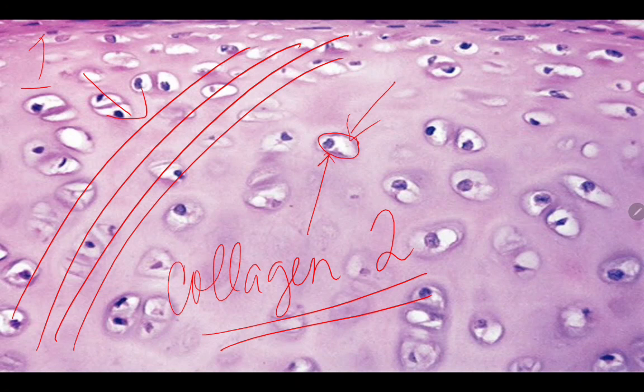So, same thing lang yan siya, guys, no? Meron siyang cell, meron siyang fibers, hindi lang talaga makita. And then, meron siyang area kung saan sila lahat nakasuspend, is what we call a ground substance. Okay? So, what I want you to know in the next slide is that meron tayong tinatawag na, actually importante rin to siya, no?